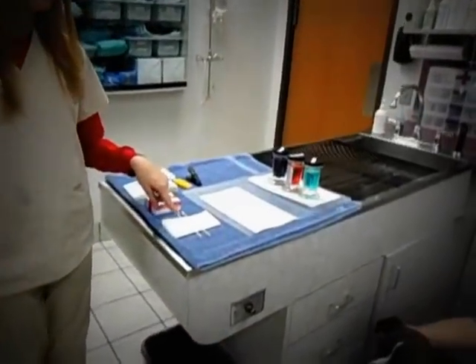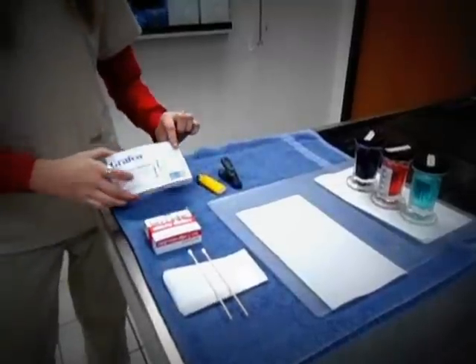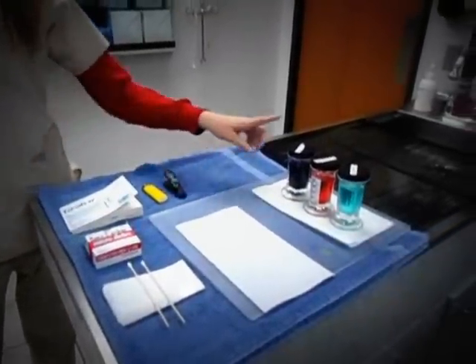To do an ear cytology, I will need two swabs, a slide, bibulous paper, a lighter, a clip, and stains.